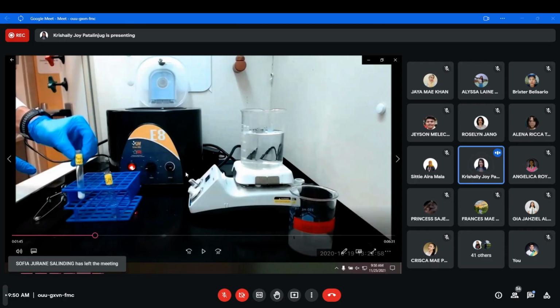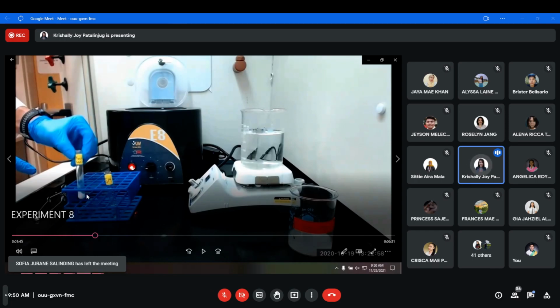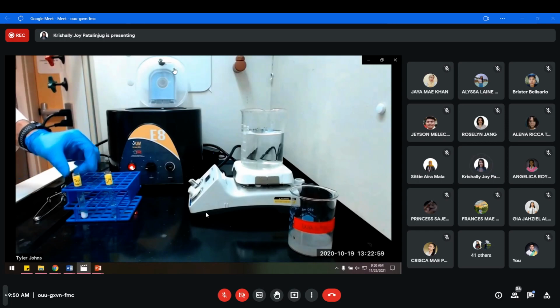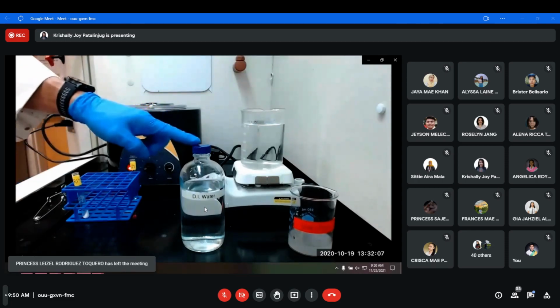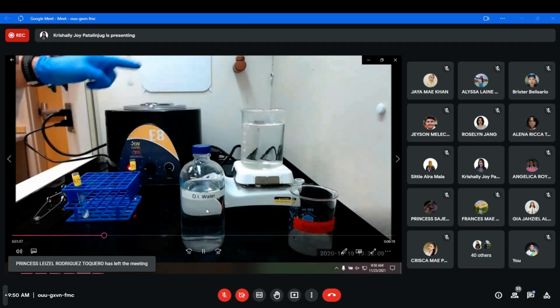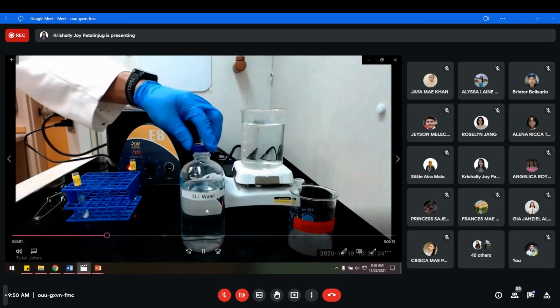Okay? Sige, let's continue. Testing already of this precipitate. The magnesium ion is later in this filtrate. We will now perform the test for barium ion. We will begin by washing residue R14 with 1 milliliter of deionized water, then centrifuging and discarding the wash liquid.